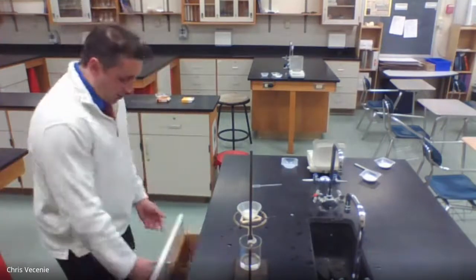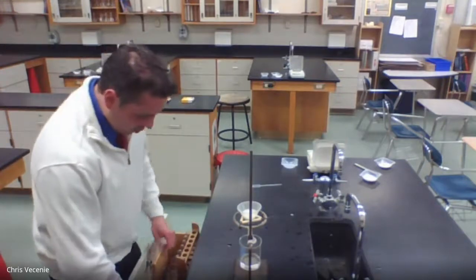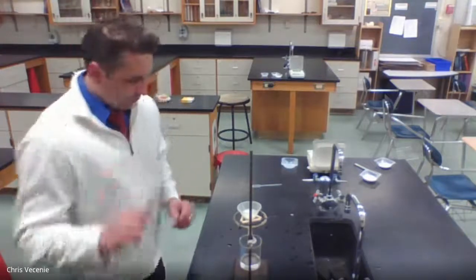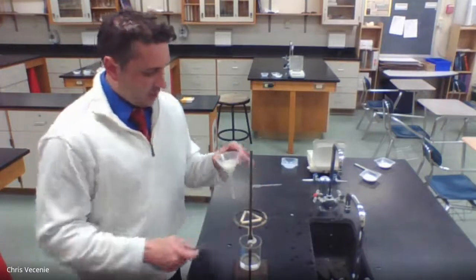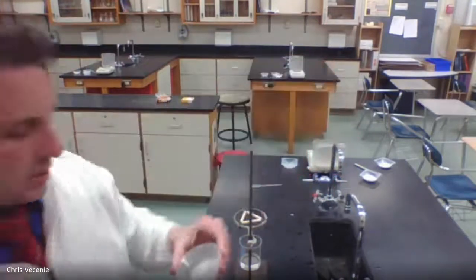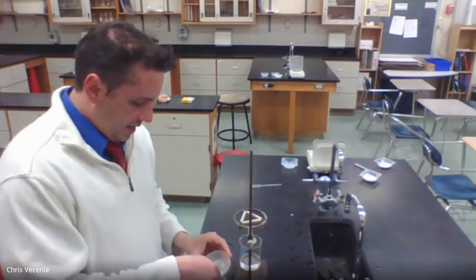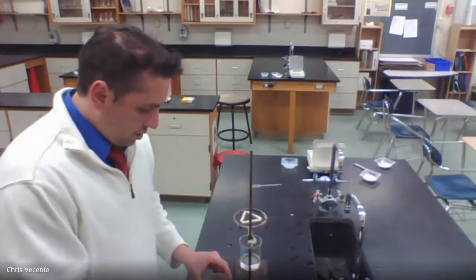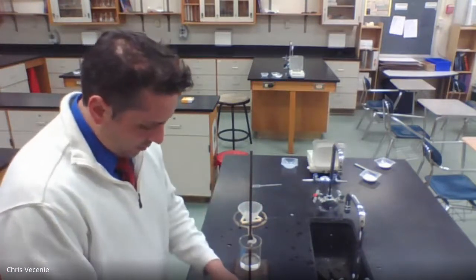All right, so the next part, you'd go in your drawer, and you're gonna want to get your forceps out, get your tweezers. And if you take a look down in the funnel, all right, some white solid in there, and it pulls up just a little, but like I said, that is going to dry when we put it in the oven.